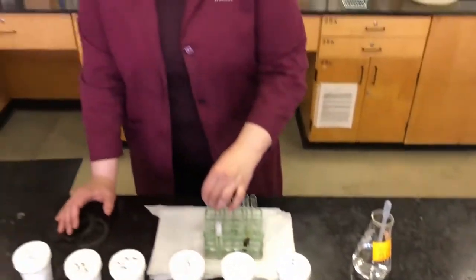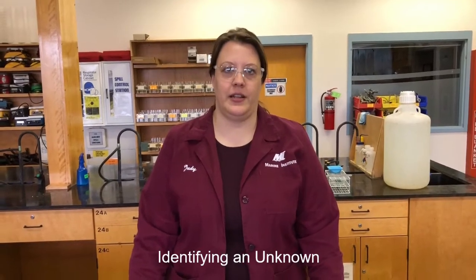So to sum that up, we had no reaction for most of our substances. We did get a gas being produced with chalk, and we also got a gas being produced with washing soda. So now we are going to look at identifying the unknown substance.